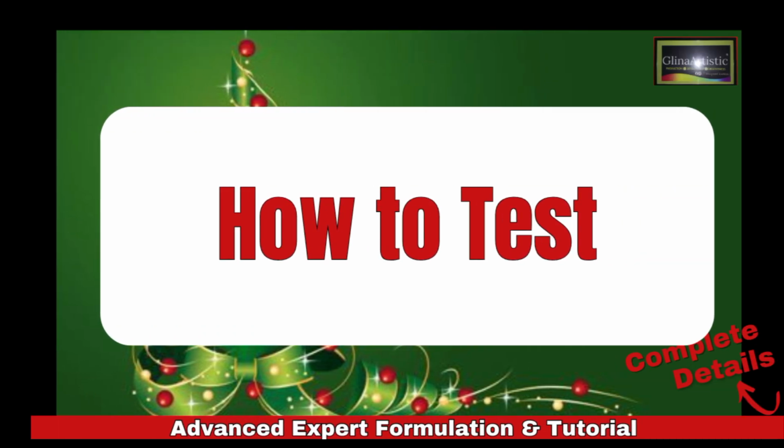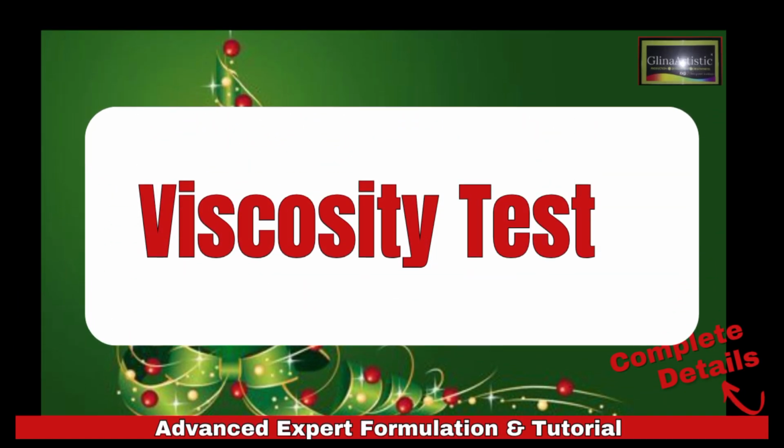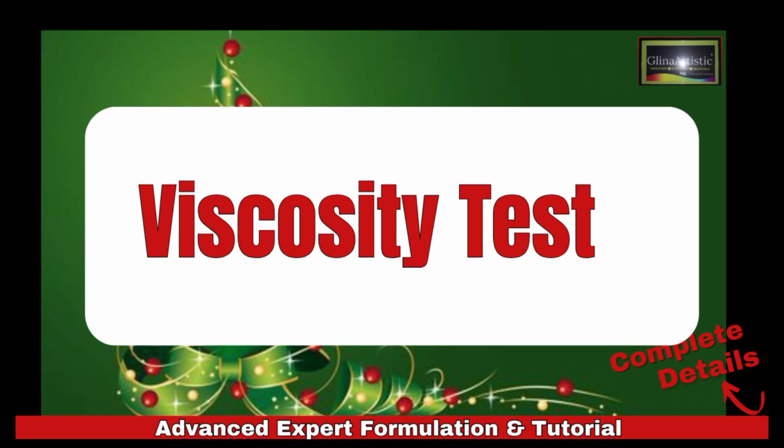And how to test for viscosity. You have to use a viscometer to measure resistance to flow. Yeah, I know you'll be surprised. Most of us do not know the meaning of viscometer.